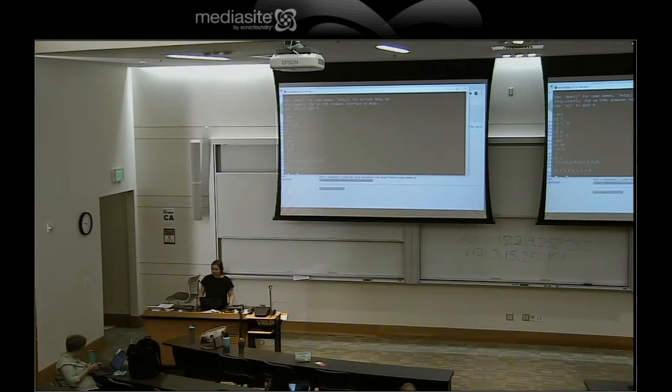Now that we have this variable set as a list, we can start doing some of those statistics I said that we were able to do in R. So we can take, say, the average of L, and it will return the average of our list. You can do a sum of L, and it will add our list up.